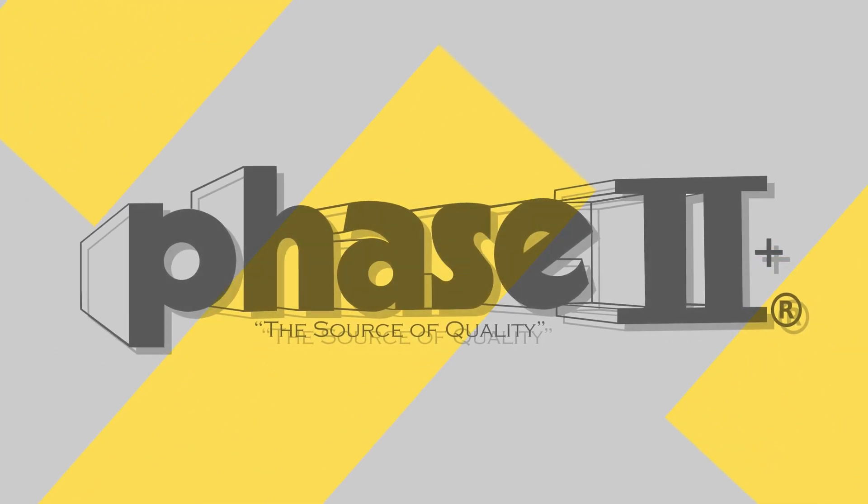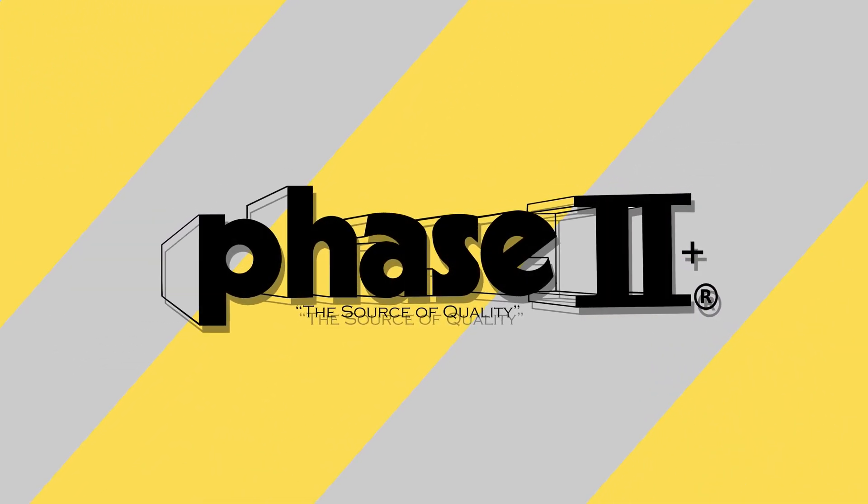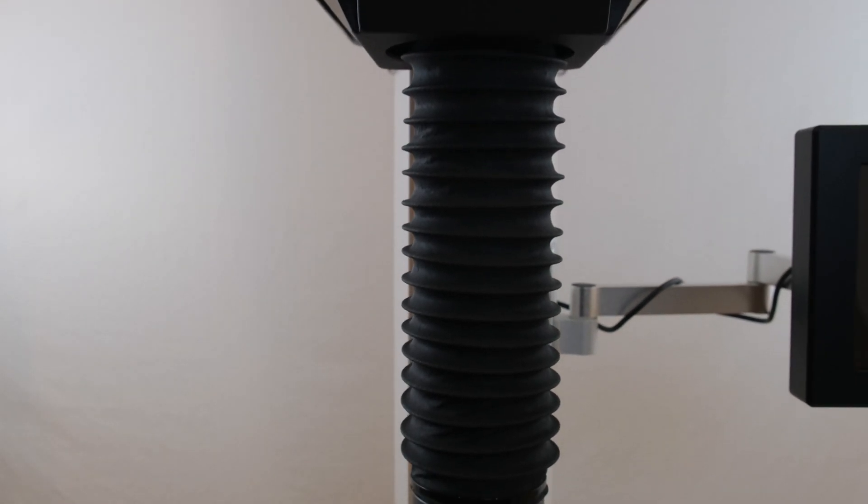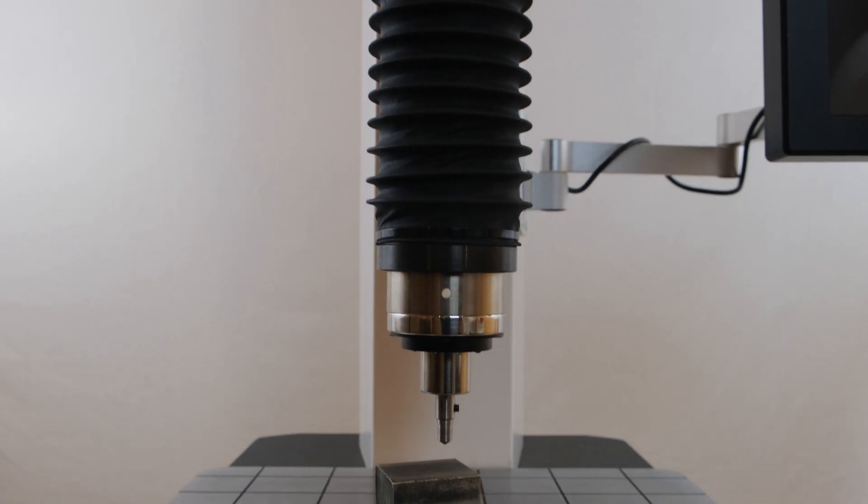This is an instructional video detailing the applications and function of the Phase II 900-475 Auto Z-Axis Twin Hardness Tester. The 900-475 hardness testers are designed to test primarily metals using the Rockwell hardness method via a closed loop load cell driven control.